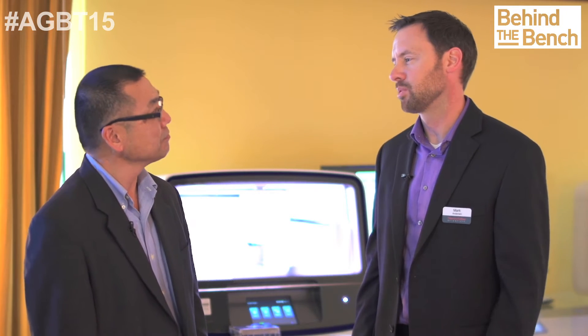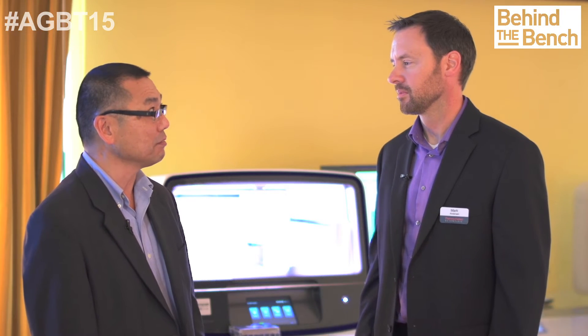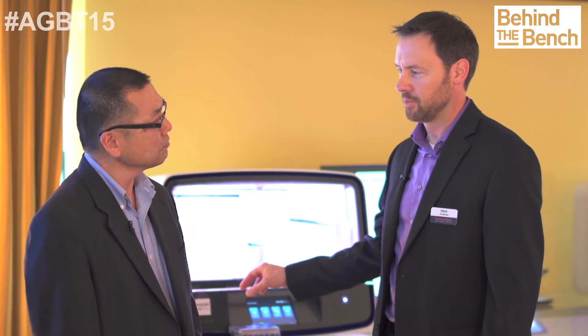What we've announced today is that we're going to introduce AmpliSeq library prep on the IonChef instrument. The configuration we're working on is eight DNA samples in and one tube of normalized pooled library out. You simply snap in the reagent cartridges and your custom or ready-to-use primer pools, add your DNA, push the button, and seven hours later out come normalized pooled libraries.